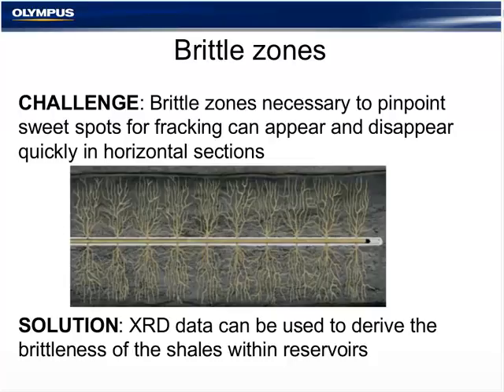So your XRF, when integrated with your XRD, can definitely help understand the rock strength and potential behavior. Your rock mechanics, such as Poisson's ratio and Young's modulus, as well as understanding the rock fabric, can be modeled with close correlation to the XRF compounds and elements.